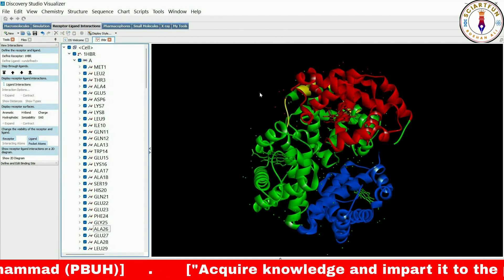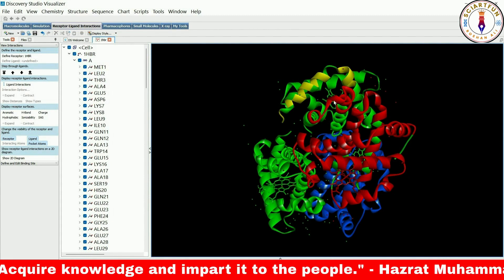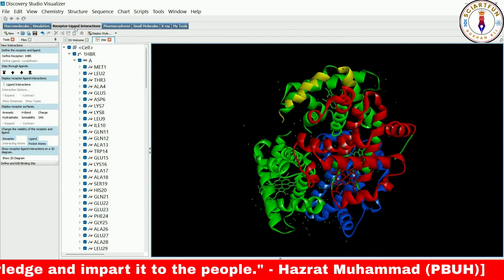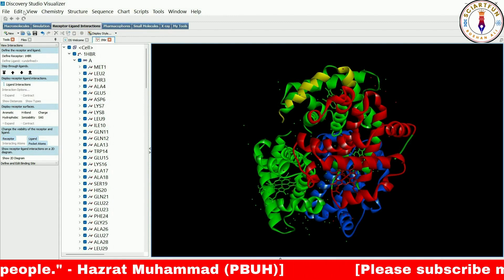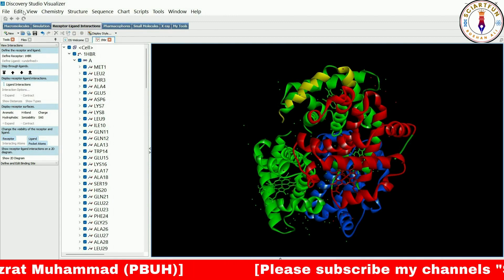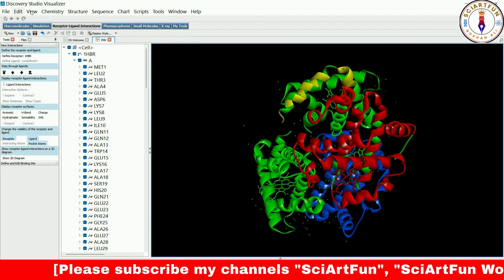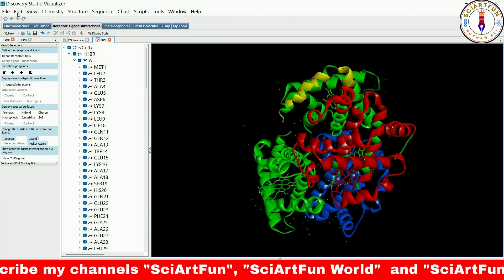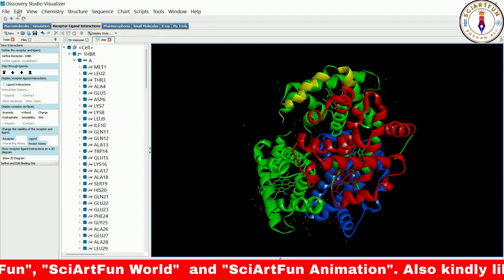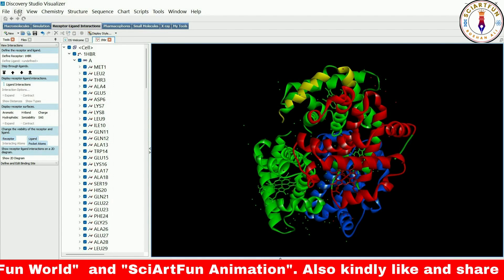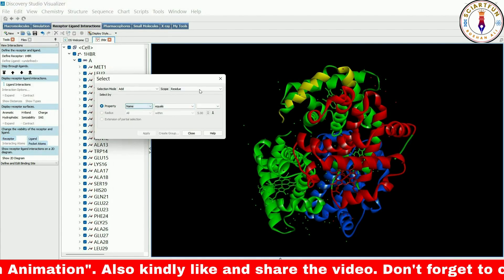Additionally, the ability to change the color of selected residues can be used for visualizing changes in the protein structure due to mutations, post-translational modifications, or other factors. This is an important tool for gaining a deeper understanding of protein structure and function. You can also select specific types of residues from the Edit Select menu and change their color.